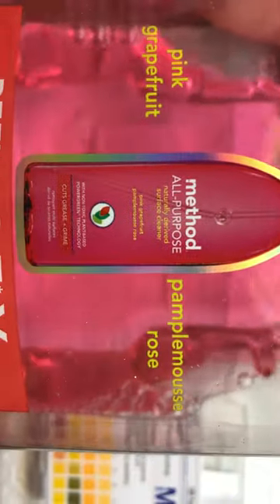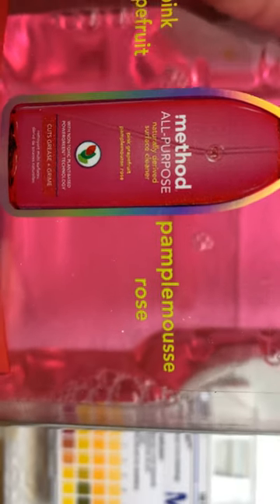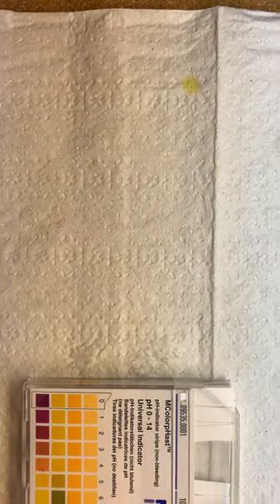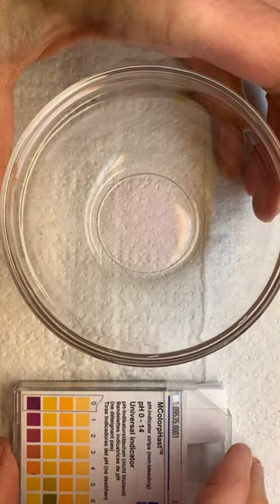Let's test the pH of some other stuff since we're in the middle of a pandemic. The next stuff we're going to test is Method All-Purpose Cleaner — Pamplemousse, right? So grapefruit, pink grapefruit. Let's try Method All-Purpose Cleaner and see what the pH of that is.